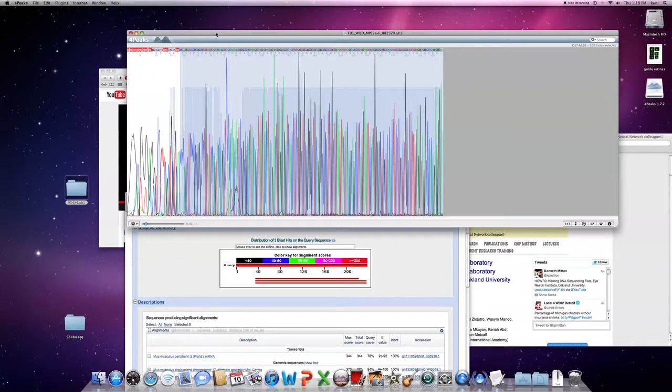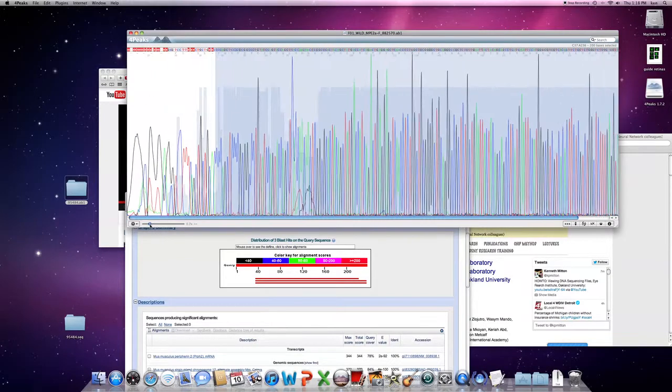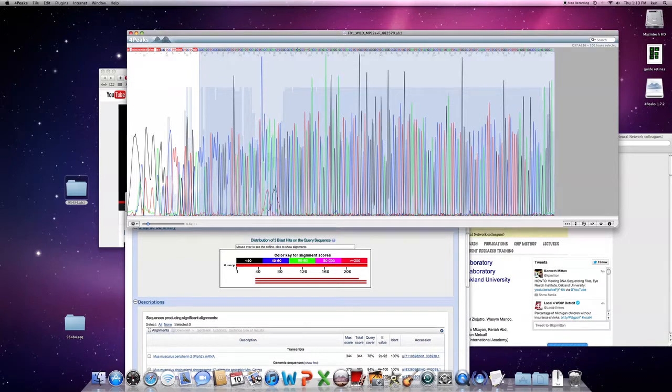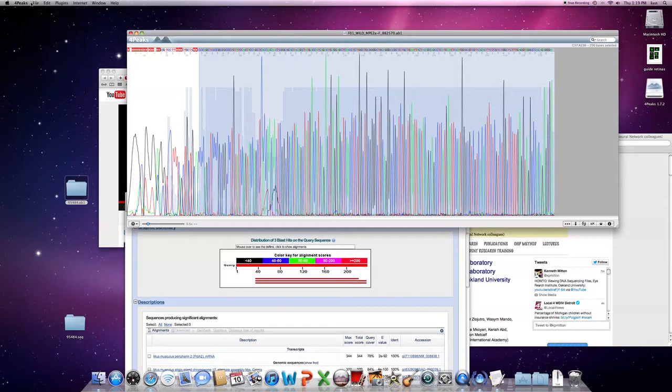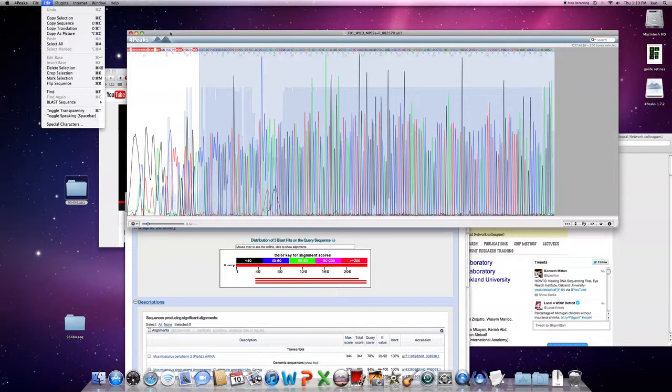So now you have your peaks and you're looking at the electrophoretogram. You think your sequence is okay and now you'd like to check and see if this matches what you think it does, say in the mouse genome. What I've done is just selected along the letter base calls here, this blued area of sequence. You can basically in 4Peaks go up to the edit menu and copy that sequence.